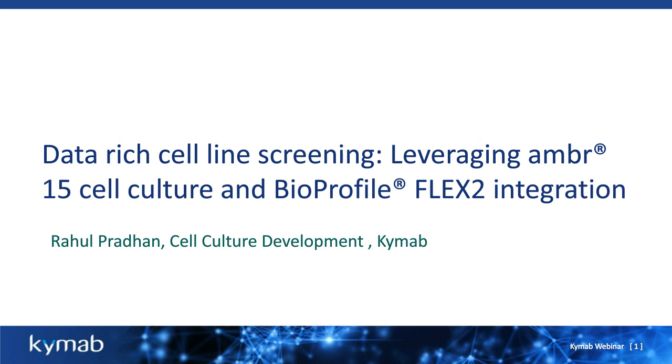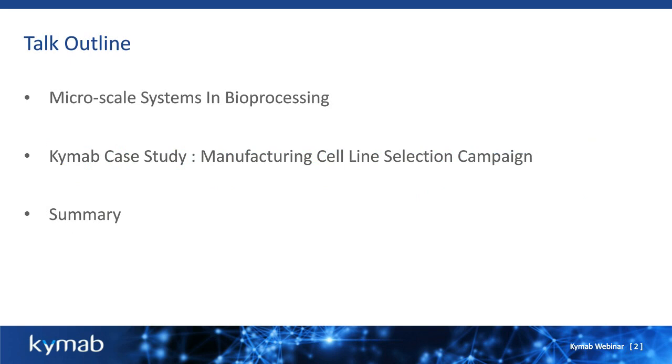So today I'll be talking about data-rich cell line screening by leveraging the integration between the ambr15 and BioProfile FLEX2. I'll start off by briefly talking about microscale systems in bioprocessing. Then I'll dive into the Kymab case study covering a manufacturing cell line selection campaign, and then conclude with a summary.